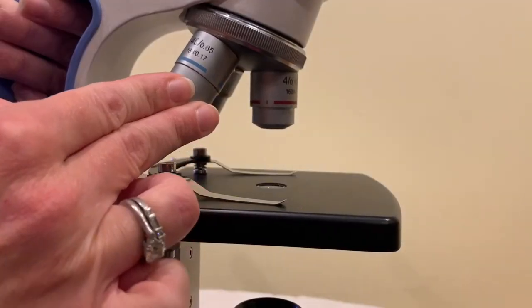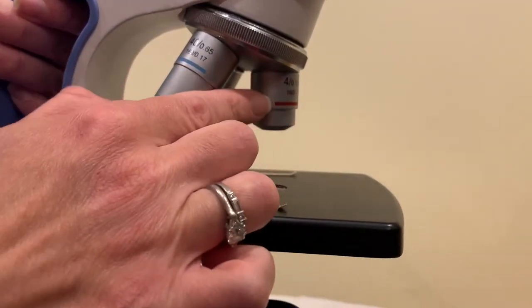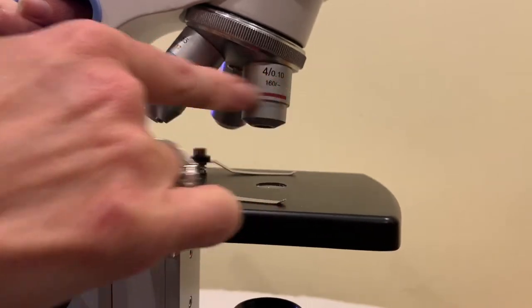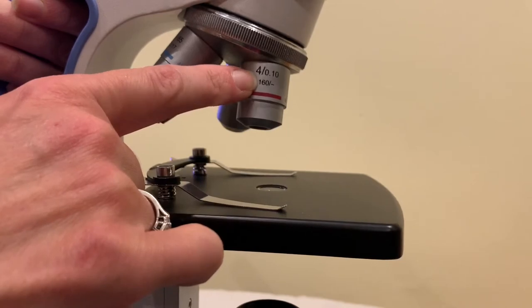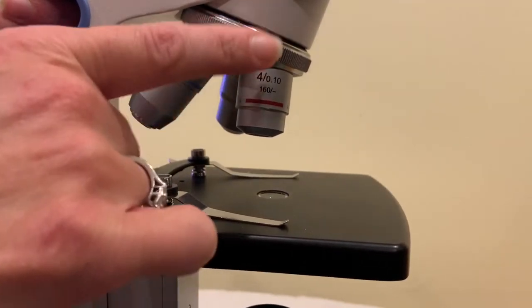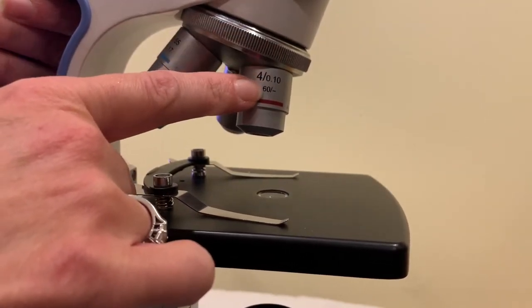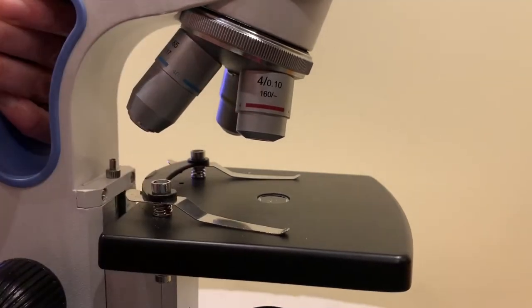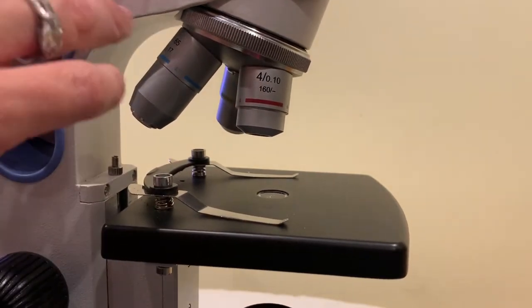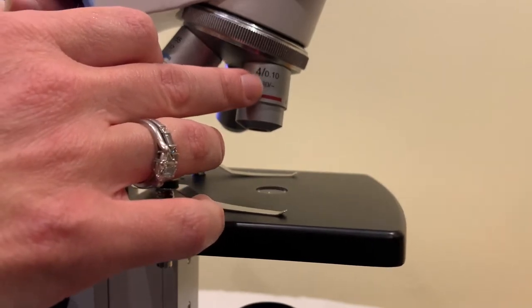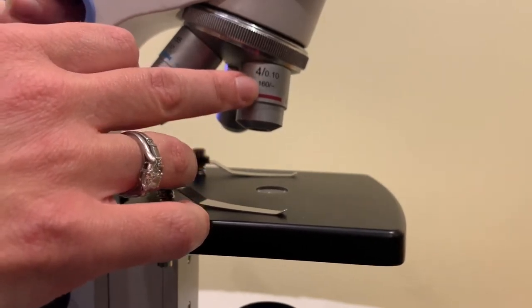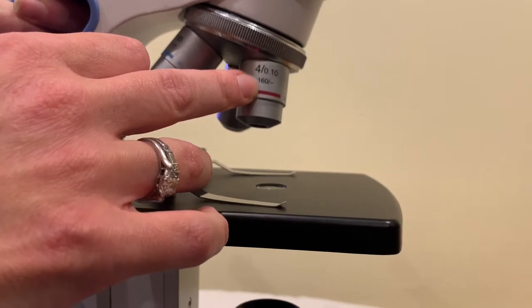We always start with the smallest objective lens pointing downwards. The smallest objective lens has a magnification of 4. So if we were to do 4x times 10x of the ocular lens that would give us a total magnification of 4 times 10 is 40. So 40x.